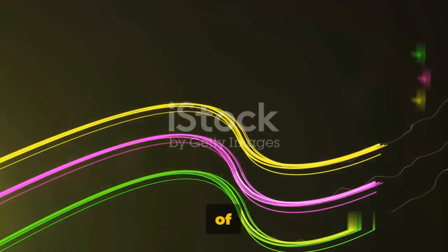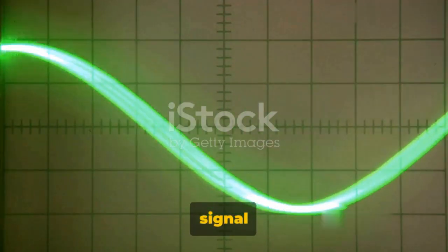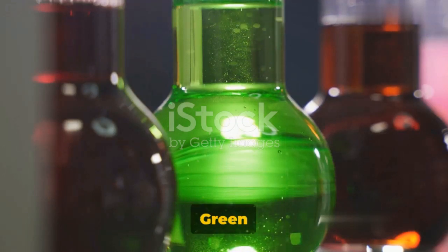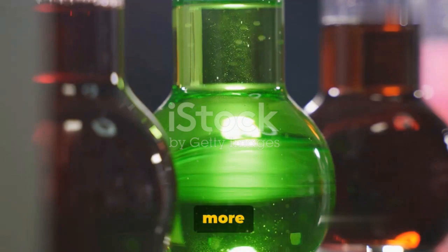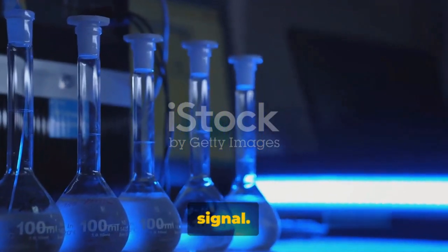SYBR Green is somewhat of a superstar in the world of fluorescence markers. Why, you ask? Well, it's all down to its high signal intensity. Other fluorescent dyes like ethidium bromide or acridine orange could be used, but SYBR Green outshines them with its stronger, more prominent signal. But it's not just about the strength of the signal.